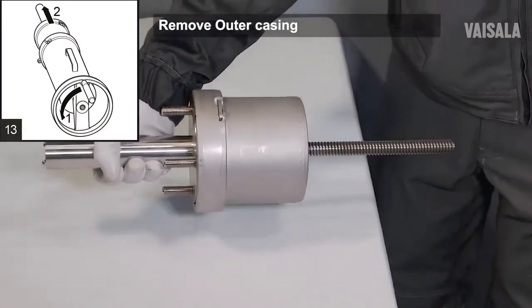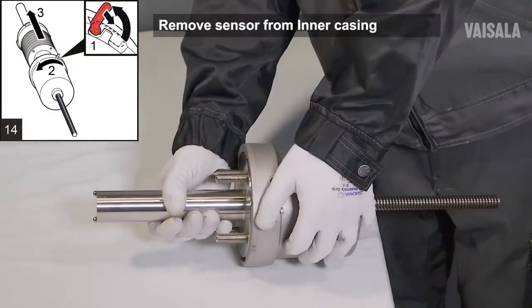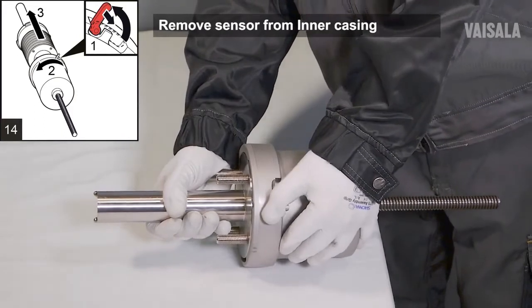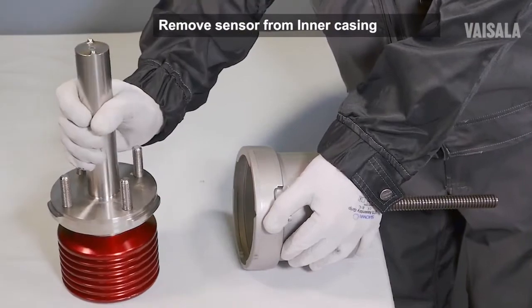Pull off the outer casing. Open the latch on the inner casing. Keep the sensor steady with one hand and rotate the inner casing counterclockwise with the other hand to unlock the inner casing from the sensor.